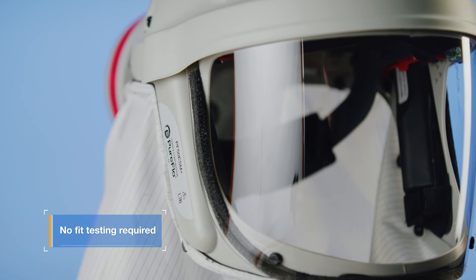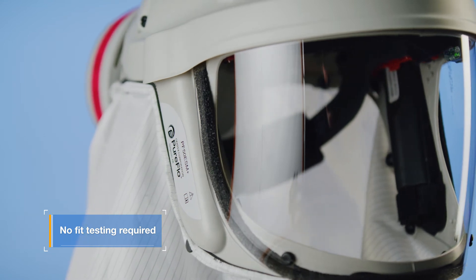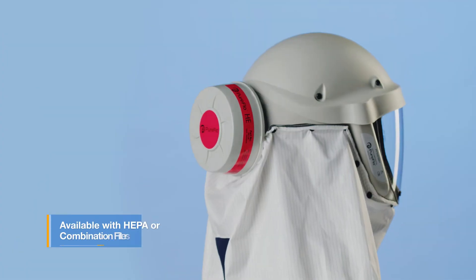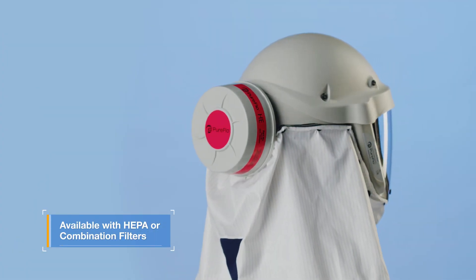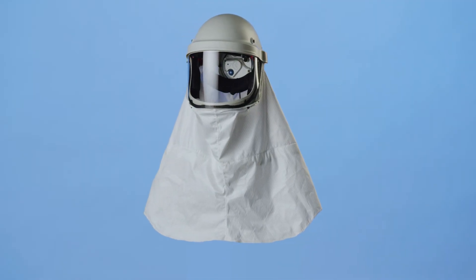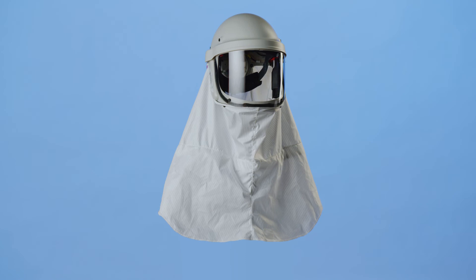Users are not required to have a face fit test prior to use, and the unit can be worn with facial hair and/or glasses. Both HEPA and combination filters are available for use with the unit. PureFlow provides the protection you can count on in high-performance environments.